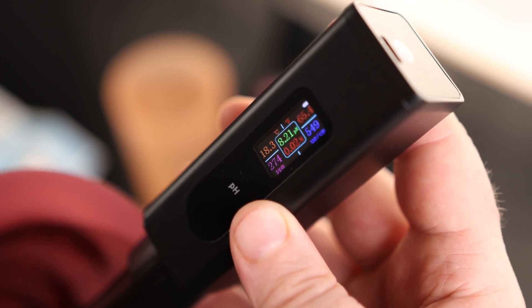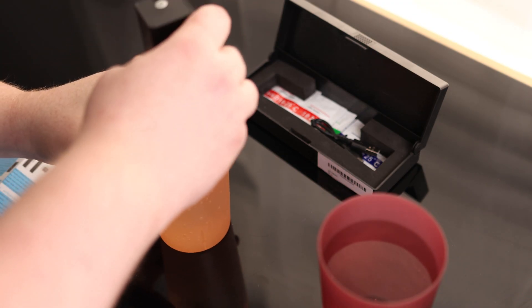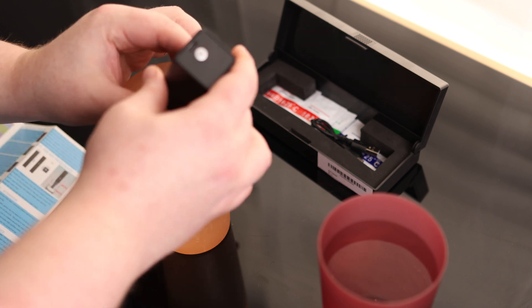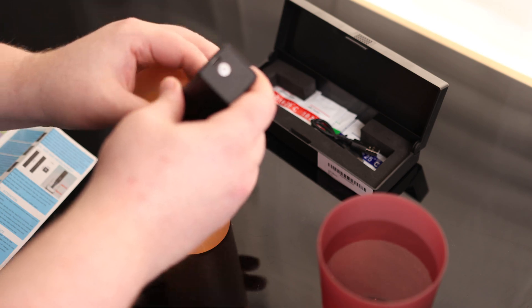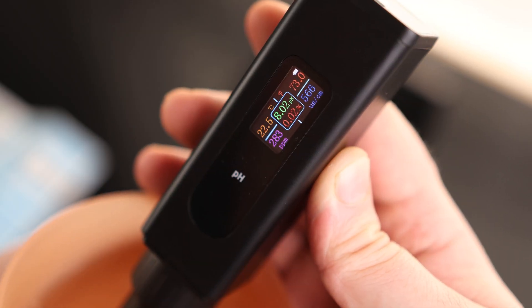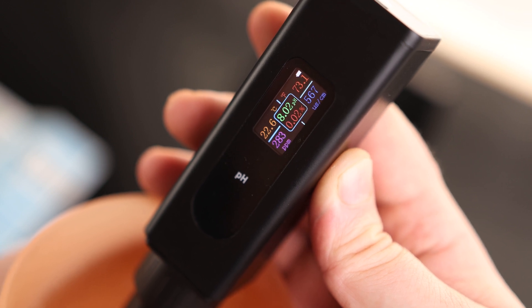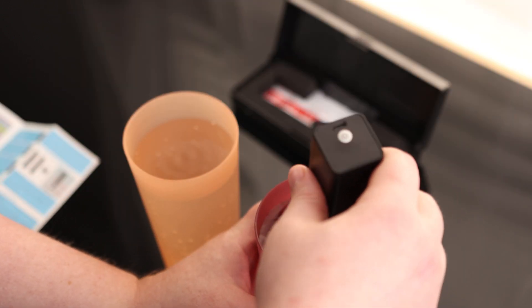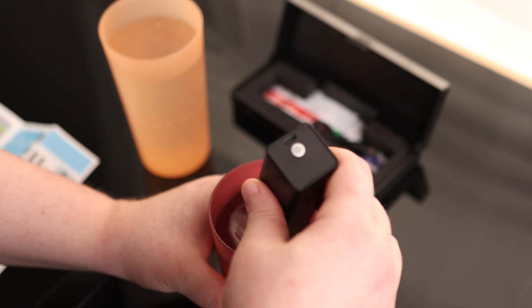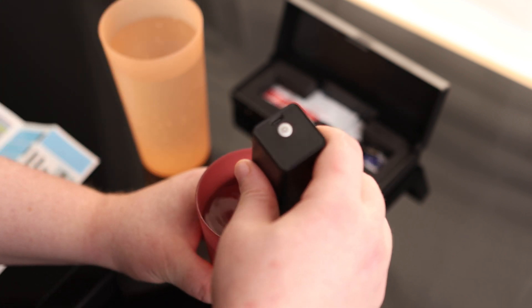So let's see how that differs to the tap water. I'm going to put this in and kind of swirl it around to also just clean off the water that was from the old test, and we'll let that sit there for about 30 seconds. So we do have a few more particles in there — it's at 284 parts per million now, but the pH is 8.03, 0.02% salinity, and the temperature is a little bit warmer. I guess this filter isn't filtering out quite as much as I figured it would. It tastes a lot cleaner, but apparently there's still a lot of particles in there. That's pretty interesting.